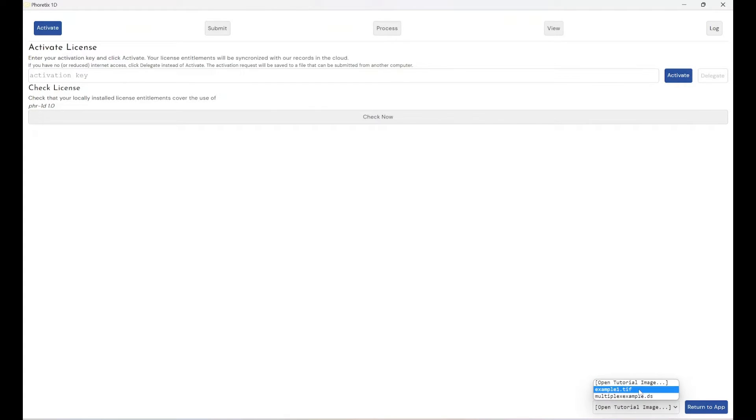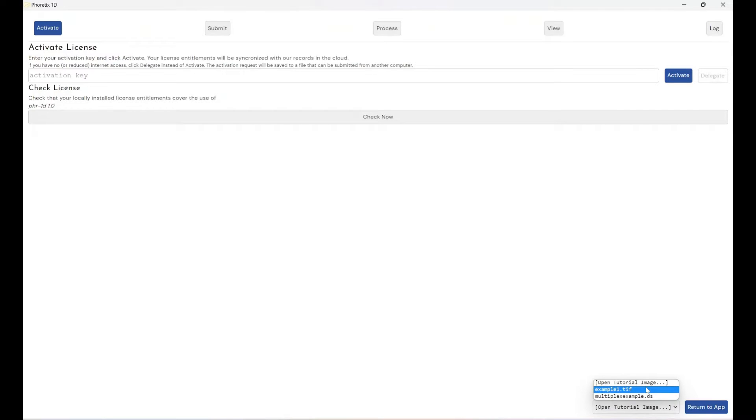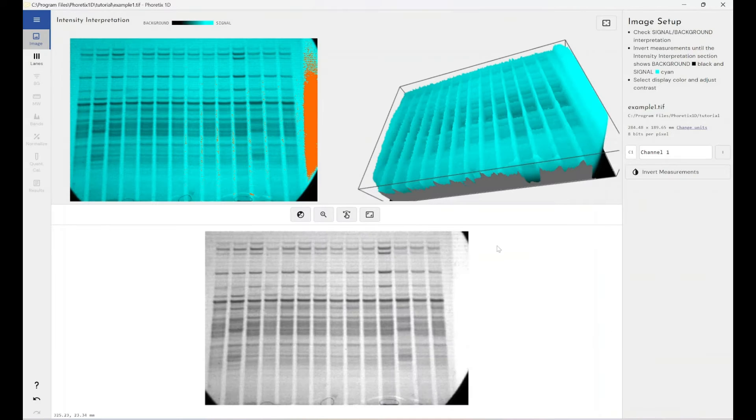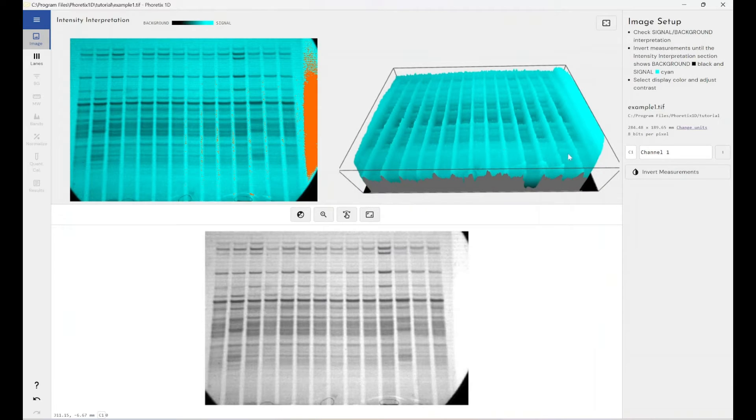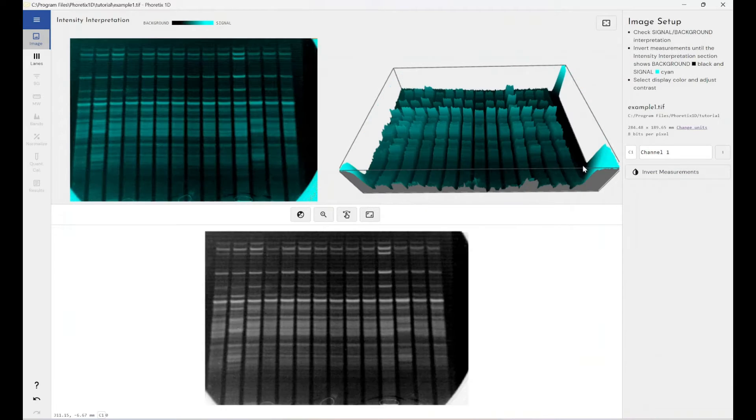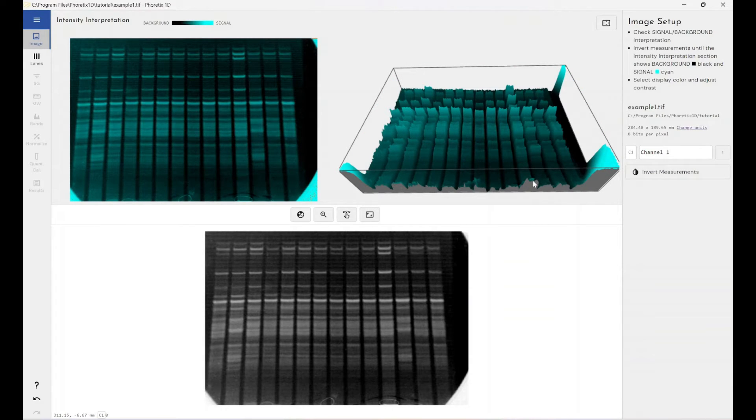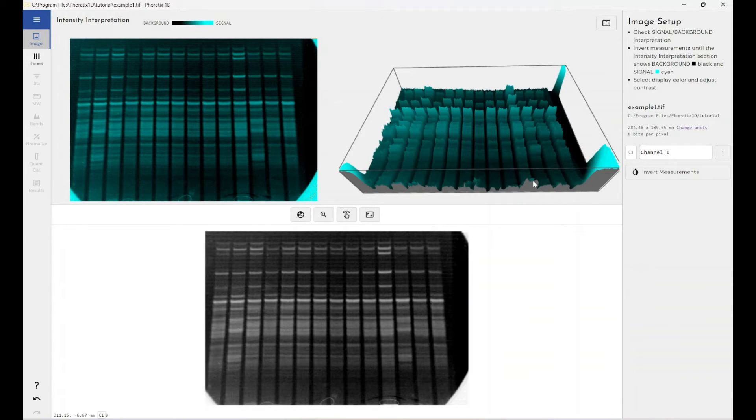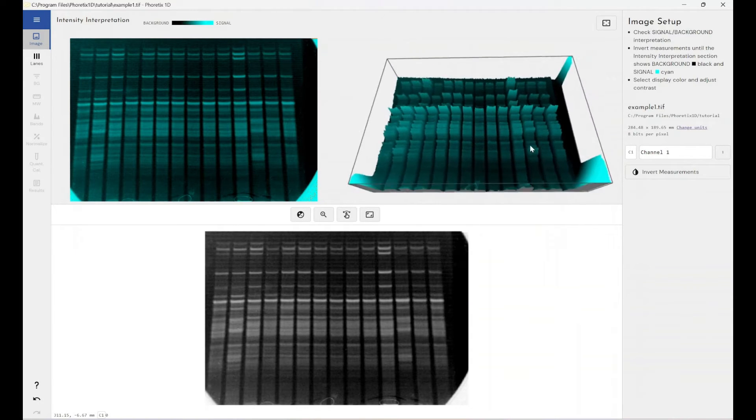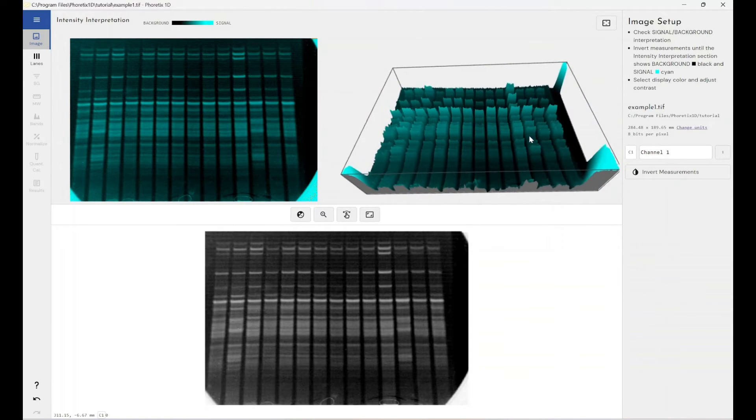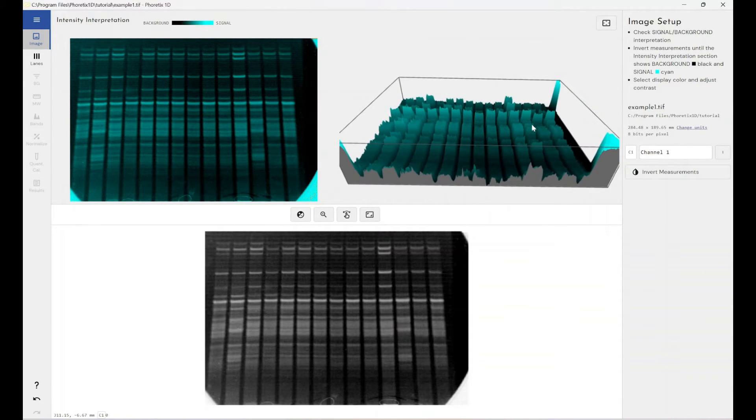Now we've got a single channel and a multiplex tutorial image that you can open within the software without having to have an active software license. So if I click on one of these, you can see that it opens up within the software and I can run through an example of what an analysis would look like. This is fantastic for training new users or for educational purposes, academic purposes within the structure of a lecture or within a practical experiment showing students how they would analyze their own images if they were to have a copy of Phoretics 1D.